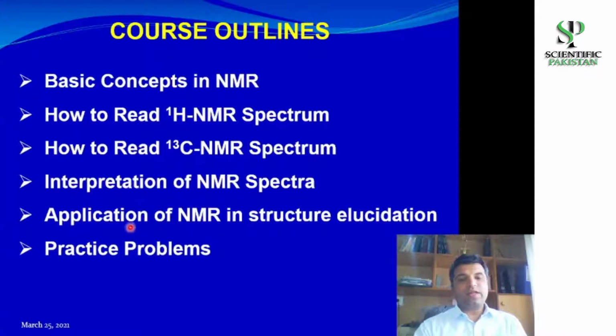And finally, we will discuss the application of NMR in structural elucidation. And later on, we will also see some practice problems. We will try to solve these structures with the help of proton and carbon-13 NMR spectroscopic techniques.